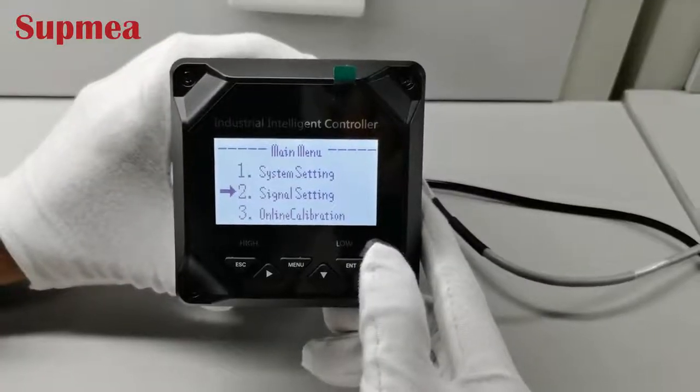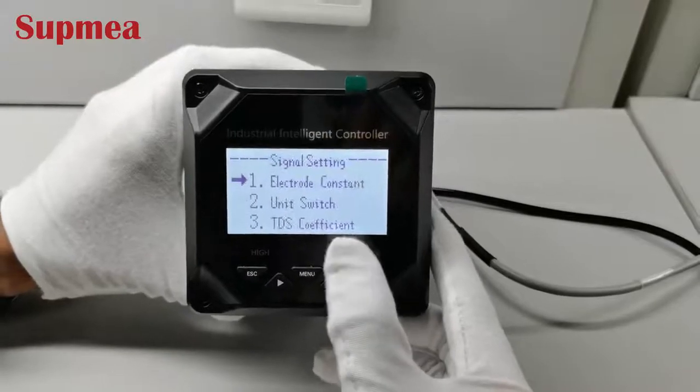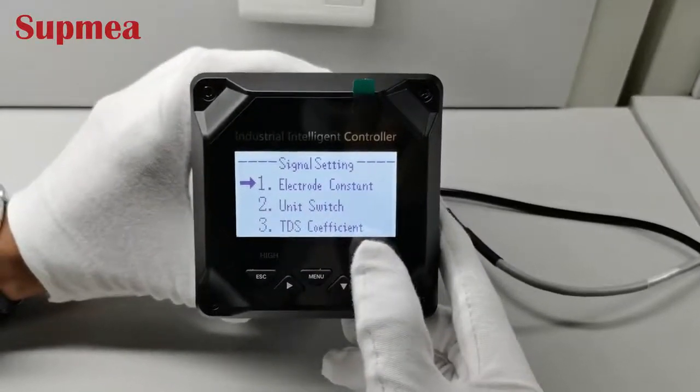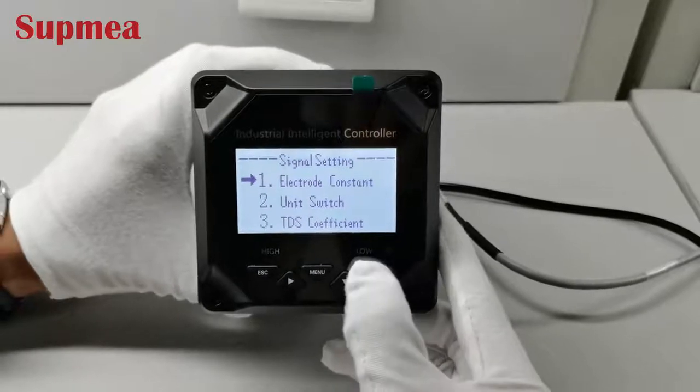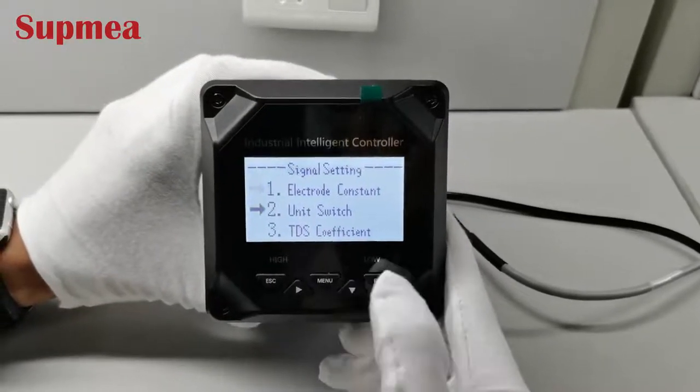Here are some features of our controller. On signal settings, you can see the electrode constant. We need to change the value of the sensor. And then, we have the unit switch.